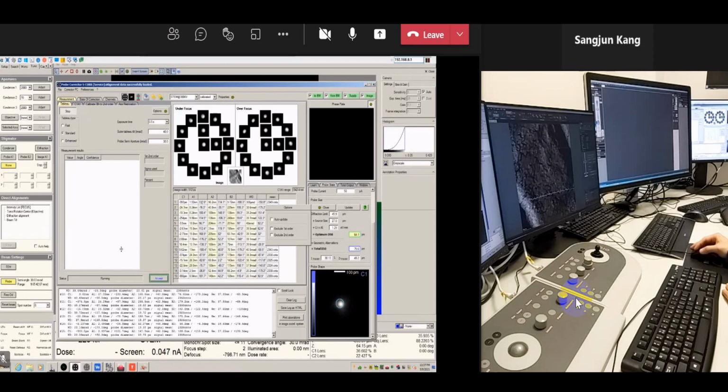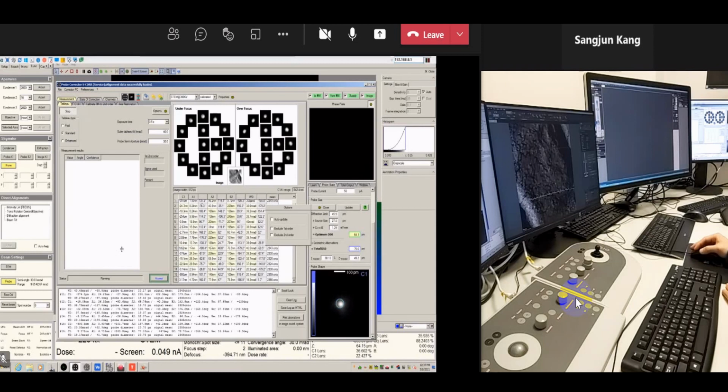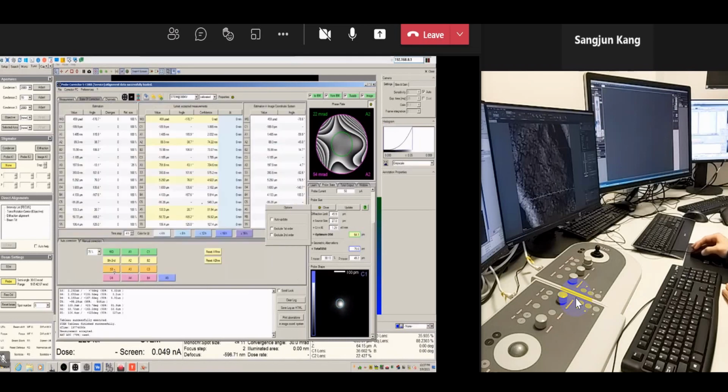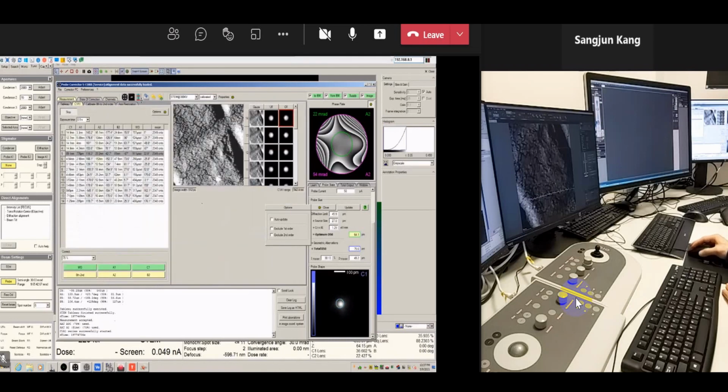The probe already looks very nice. So we have A3 and A2. Yeah, maybe this. Yeah, that's going to be the really last measurement.